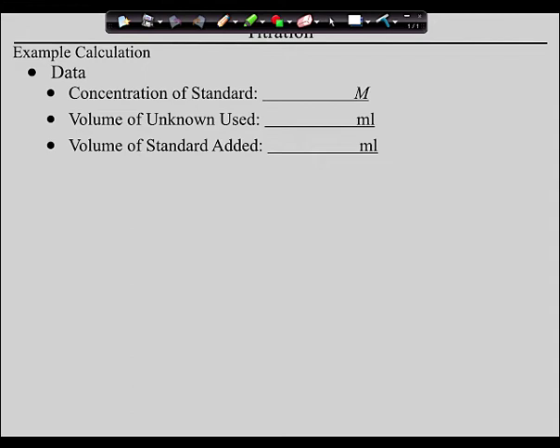Now, guys, you think this is magical, wait until next year in AP Lab where you get into your lab drawers for the first time and find out there's one of these in all of the AP Lab drawers, and it's like Christmas in August because you don't have to stir solutions anymore, because every AP Lab that we use that needs to be stirred, you'll use one of these because it's a more effective way to stir. Won't that be fun?